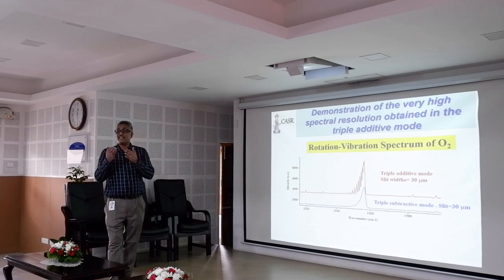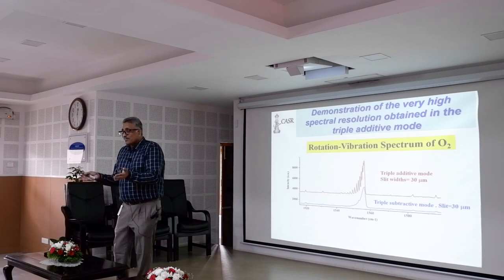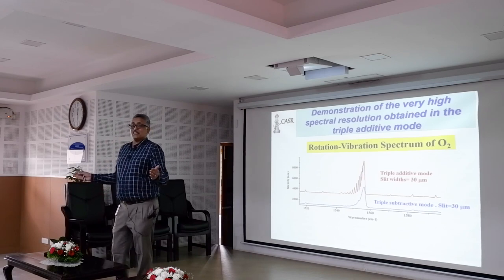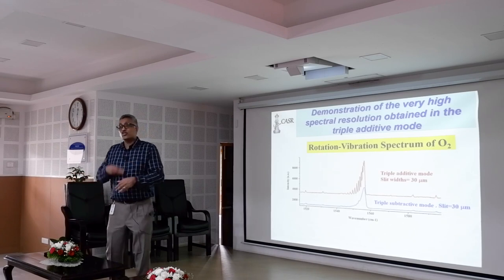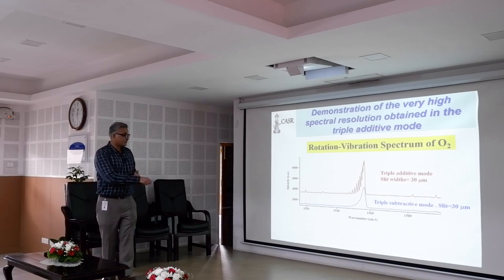So you can see, this is only an example to show you that I can actually see this kind of thing, and that's what changes the cost of the Raman spectrometer. If I have a lesser resolution Raman spectrometer, it costs less. Higher resolution Raman spectrometer, higher. So now you know how to look at it. What is the resolution of your spectrometer? So that's what it is.